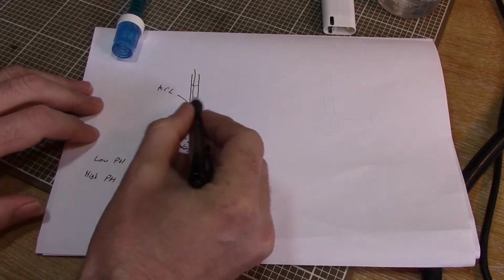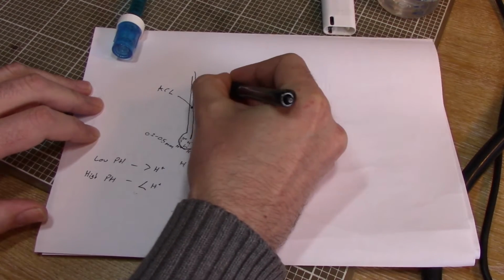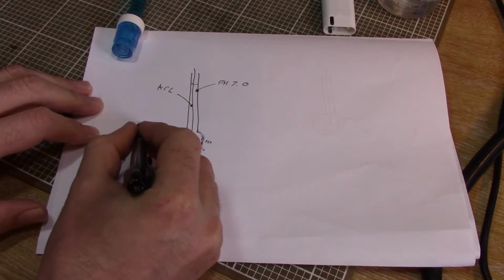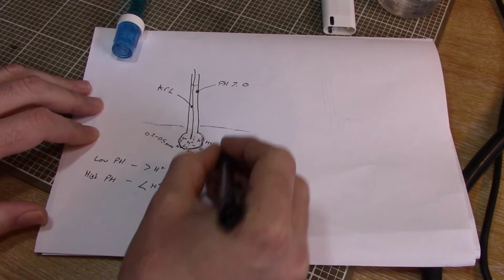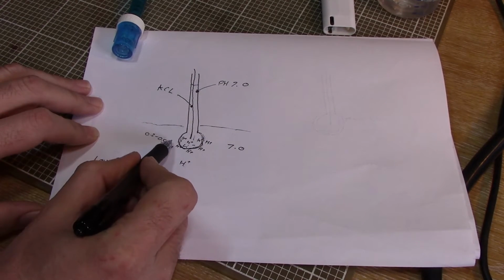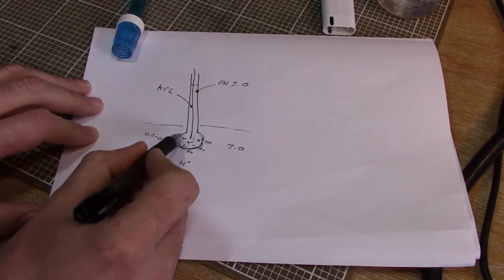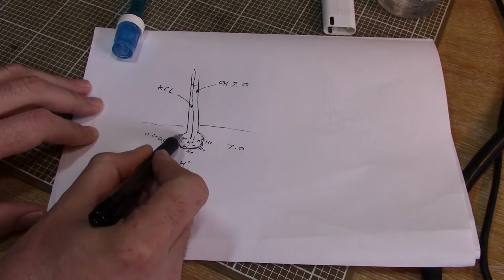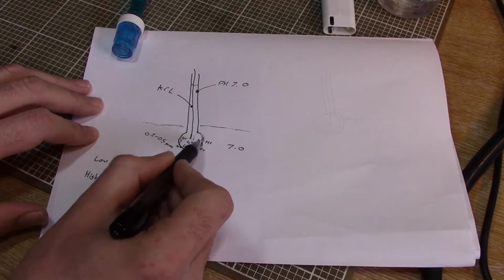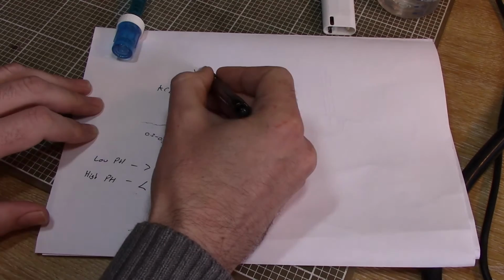Now our reference potassium chloride solution will have a pH of 7.0. Now if the solution we've dipped our probe into also has a pH of 7.0, then you get the same number of hydrogen ions attracted to the outside of the glass layer as are on the inside of the glass layer. So there's no actual difference between the two, and this would give us no voltage, no potential difference, no voltage on our silver wire here.